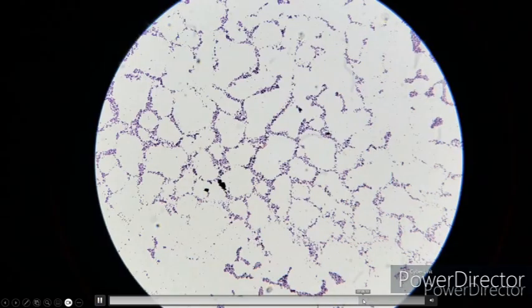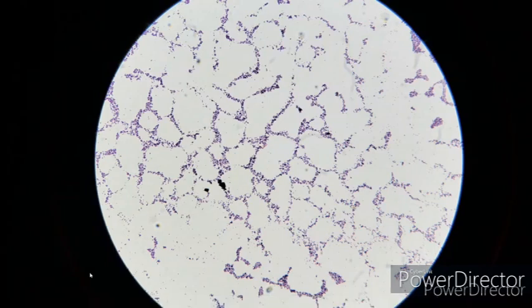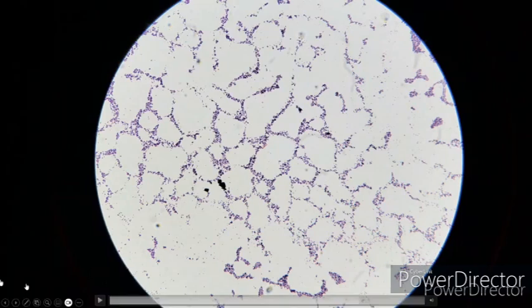So I'm going to pause right here because this is what I was originally going to show you. This is how the 50x looks, and I found a pretty good spot where I could read and really make sure that this is a gram-positive staph. They are little cocci in clusters, perfect as they should be. And we would also expect this organism to be gram-positive, so that's good.